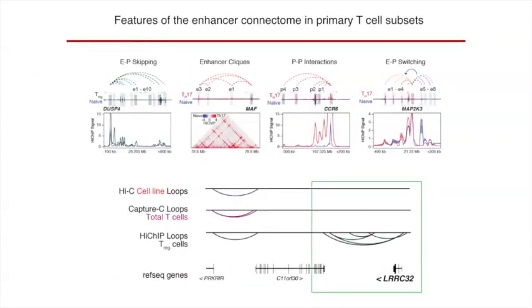Okay, so does the data that we get actually tell us something that's unexpected? Do we get complex 3D interactions that we couldn't have predicted just from proximity to a gene or one-dimensional data? And the answer, of course, is that we get a lot of complex interactions. About 80% of the interactions that we see are some type of complex, unpredictable behavior.